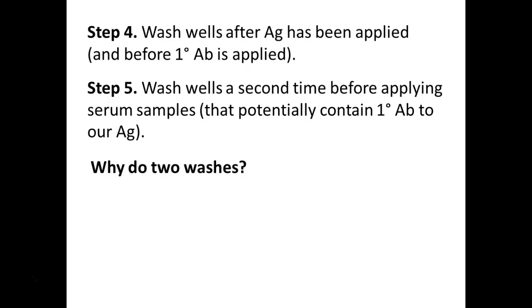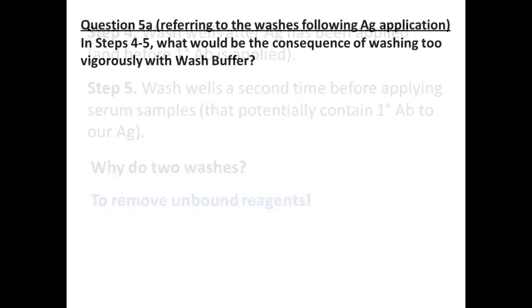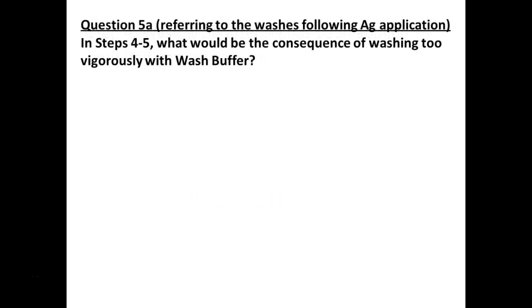Why do we wash? Wash away what doesn't stick. Anything that's unbound we want to wash away. Okay, so what would be the consequences if we wash too much, though?